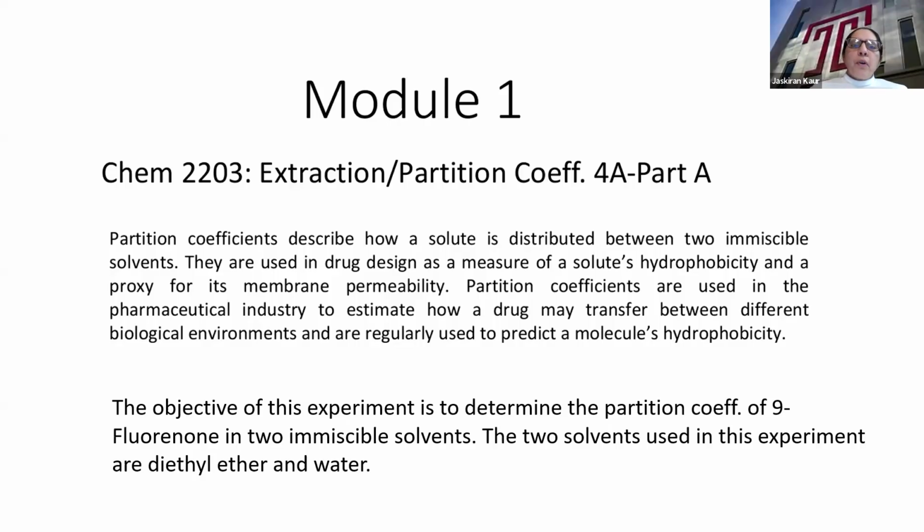Dear students, welcome to Orgo 1 Labs. This is your first lab of the semester. In this lab, you will use a technique called extraction to determine the partition coefficient of a compound. The compound used in this experiment is 9-fluorenone.